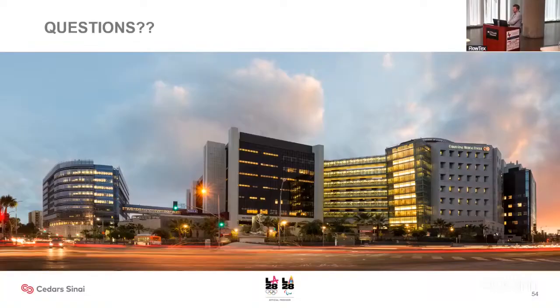Yeah, and I agree. I'd rather fix the problem than have to adjust the problem. And I think it really comes down to starting to think about the standardization and everything. When we switch QC lot beads, our spectral libraries no longer make sense because our instrument gain settings are changing. So we've started to think about how we can not let the gain settings change on an automated basis, but rather we adjust that slightly too. Because I'd rather fix the problem than adjust for the problem.